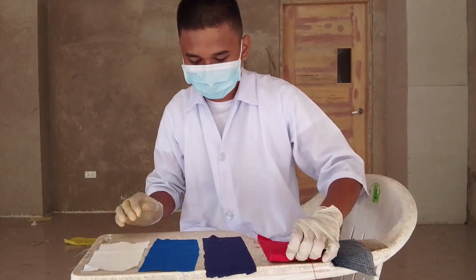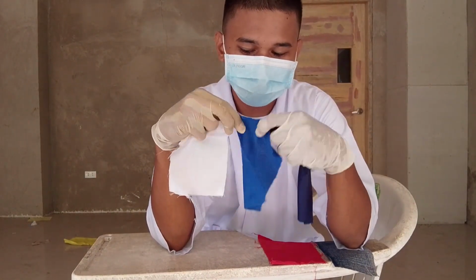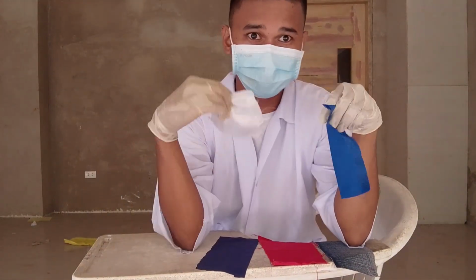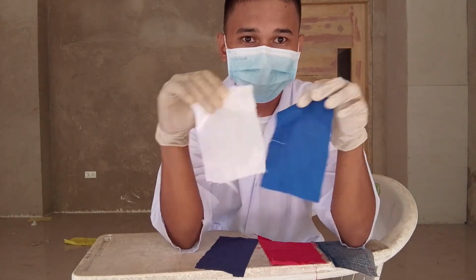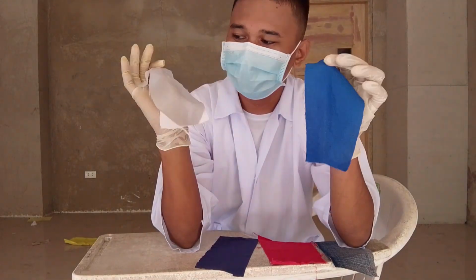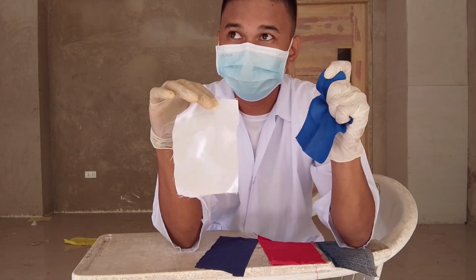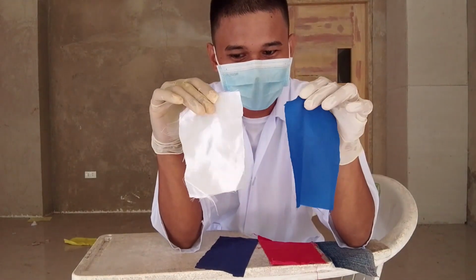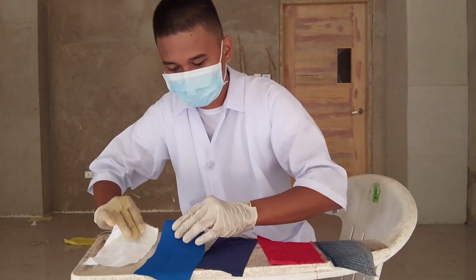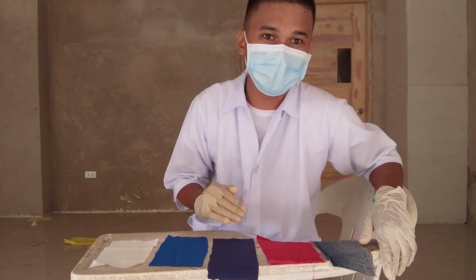Next is these three. The jersey fiber, the satin, and the silk fiber have the characteristics of a soft fabric. The difference between these two, the satin fiber and the silk fiber, is that the silk is silky and soft. And in terms of cost, the silk is more expensive than the satin. And that's all. I am done comparing and identifying the different types of fibers.